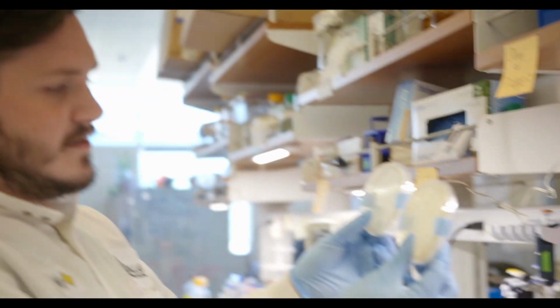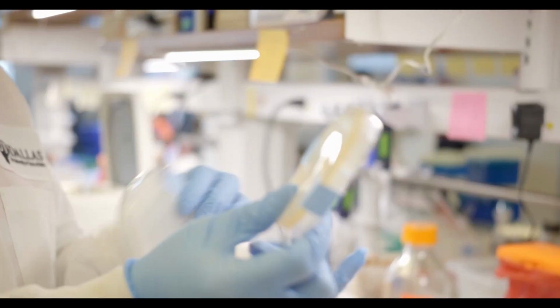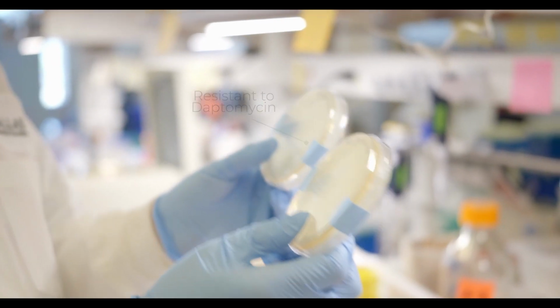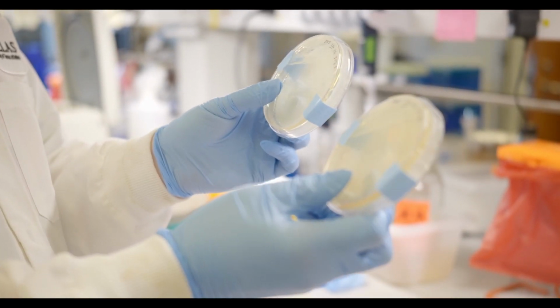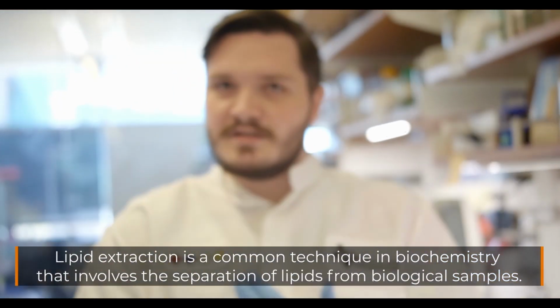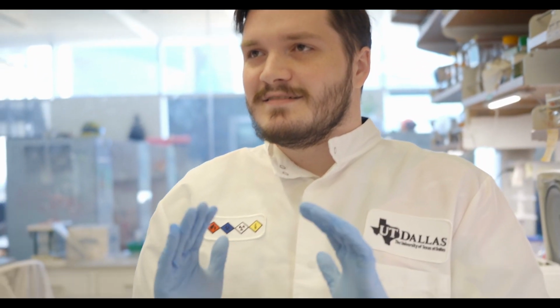So this is a pair. This is one that has been isolated from blood that is susceptible to daptomycin, and this is a homologue that is resistant to daptomycin. So we're getting ready to grow these in overnight cultures, and then we're going to isolate them and do lipid extractions, and then send them to another one of our collaborators at Duke University, whose responsibility is lipid identification. So we're going to see what the changes in lipid composition of the cell membrane are that allow them to be resistant to daptomycin.